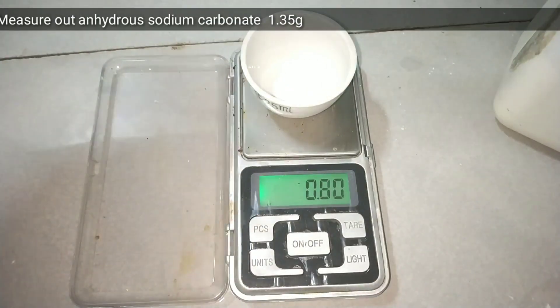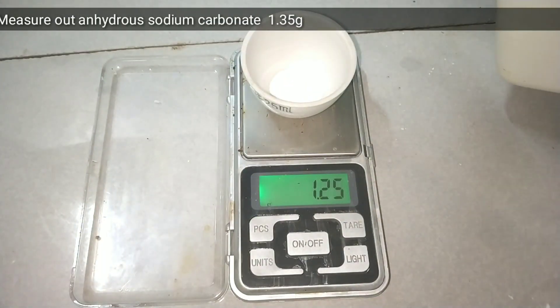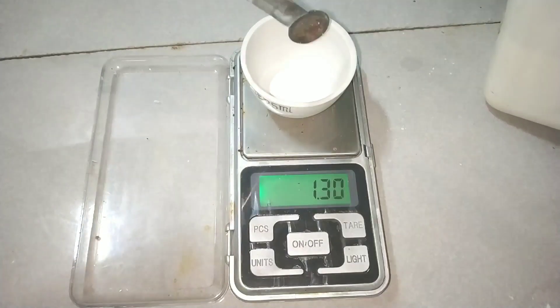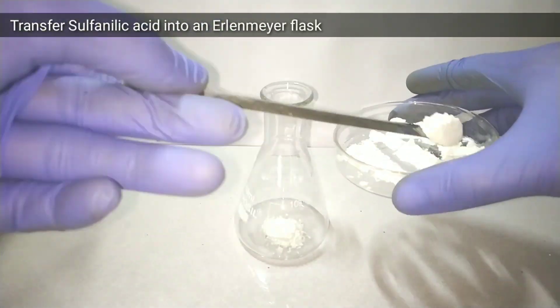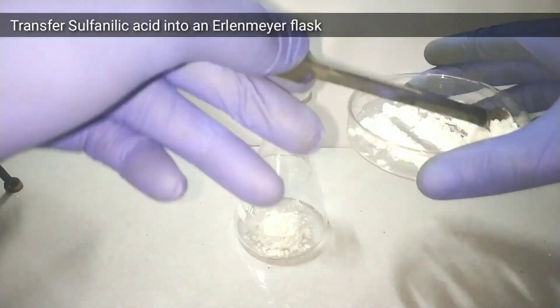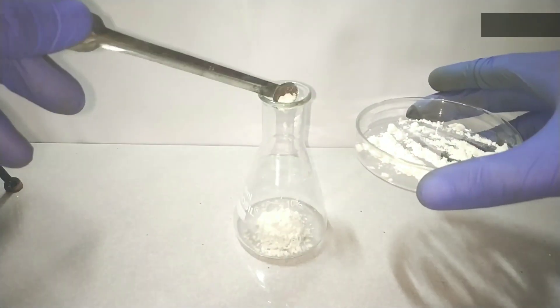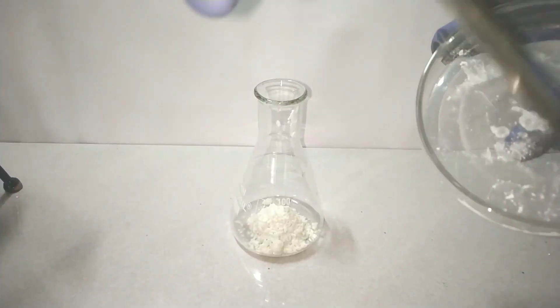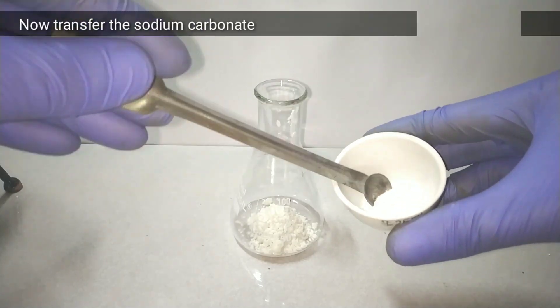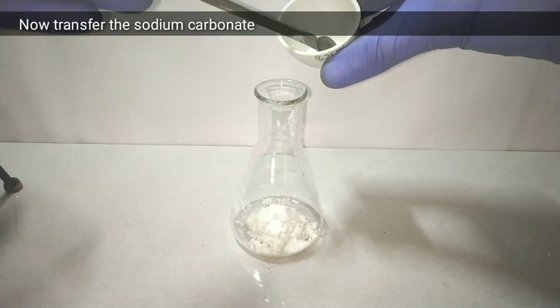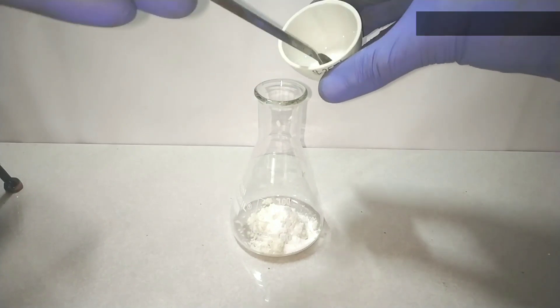Next we measure out 1.35 grams of anhydrous sodium carbonate. Sodium carbonate is available as soda ash or washing soda. Now we transfer the measured sulfanilic acid into a 100 ml Erlenmeyer flask. On top of that we add the anhydrous sodium carbonate which we just measured out.